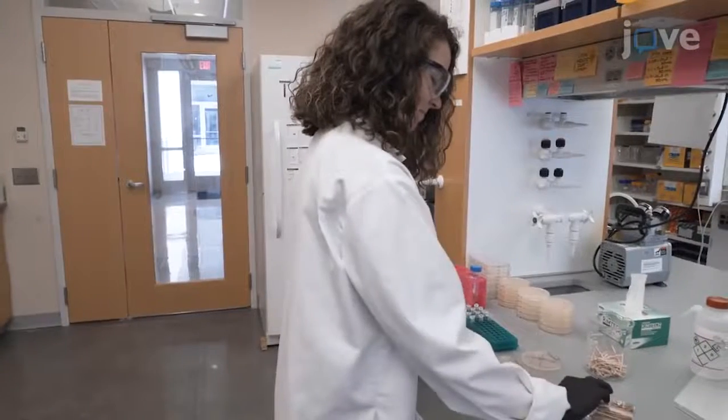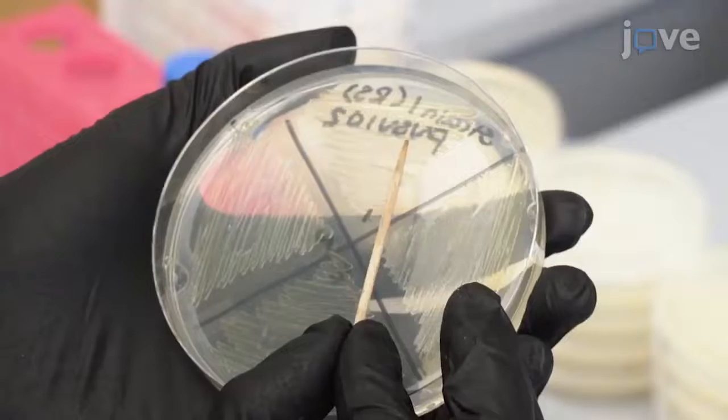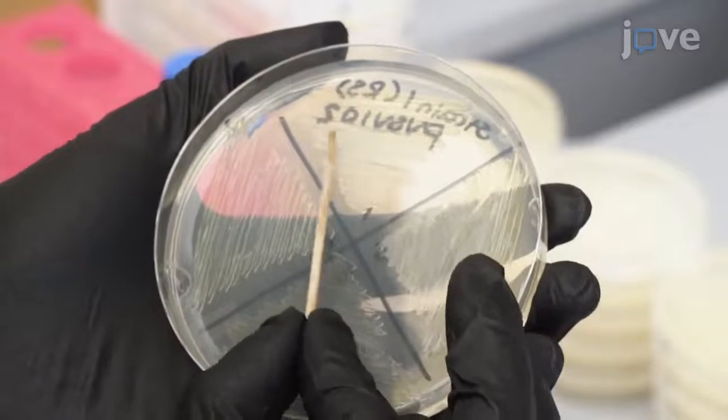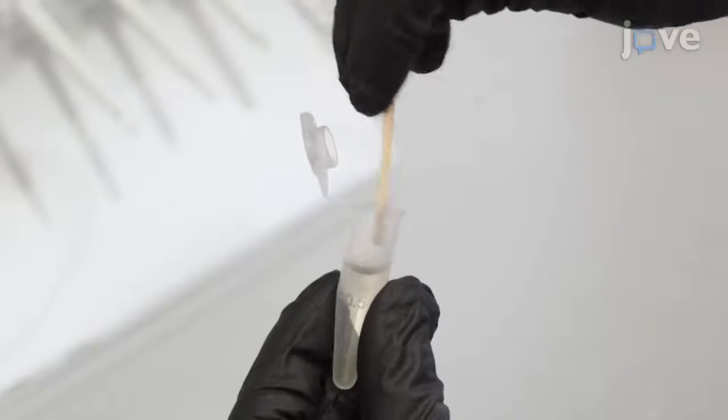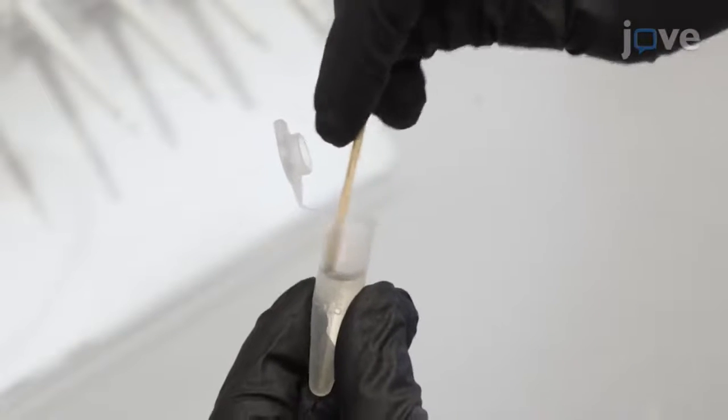To begin, use a sterile toothpick to scrape the cells from the agar plate in the size of a grain of rice. Resuspend the cells in a 1.5 milliliter microcentrifuge tube containing 1 milliliter of LBS broth.